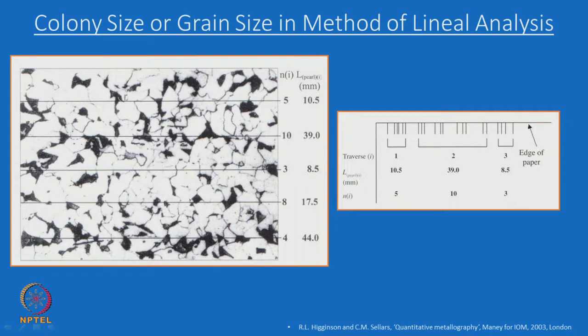Like that you calculate the intercepts and then measure this linear analysis using the intercept method.